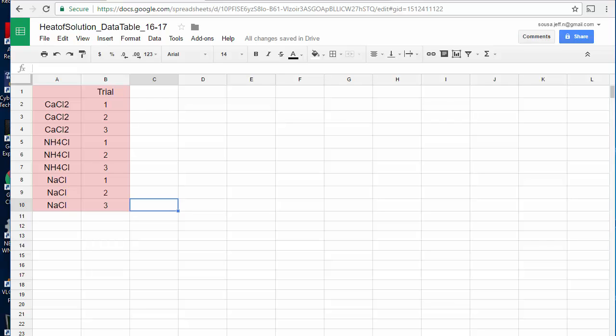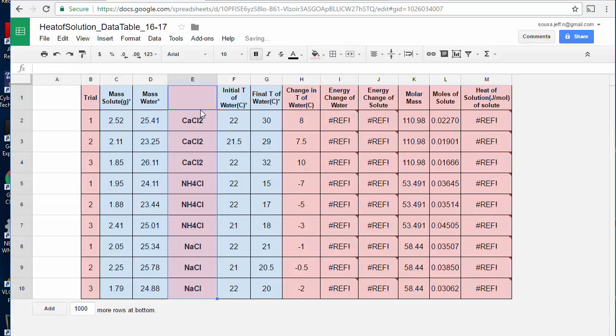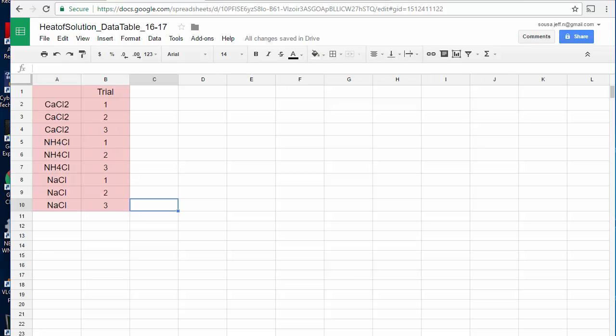So now's a great time for you to pause the video and take a few minutes. And really what I just need you to do is set up the spreadsheet that is on your data table, exactly as you'll see it. Once you get it set up, we'll kind of reconvene and then we'll go from there. All right, good luck. Let me know if you have any issues and we'll come back in.